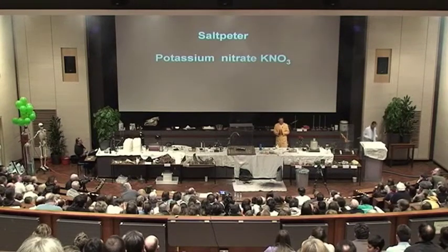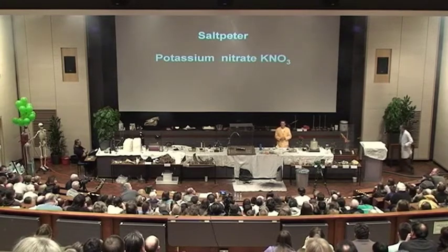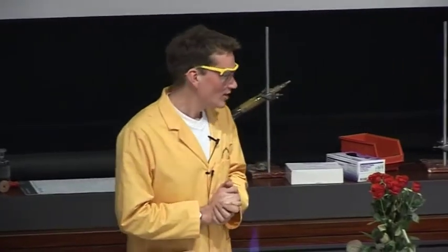Potassium nitrate — salt peter — is one of the key ingredients in gunpowder. So I thought I should show you some gunpowder here.